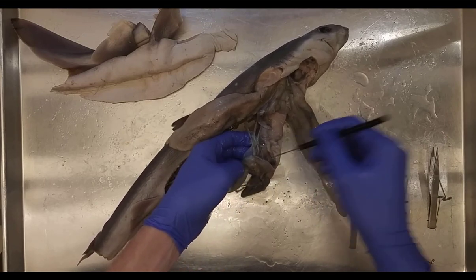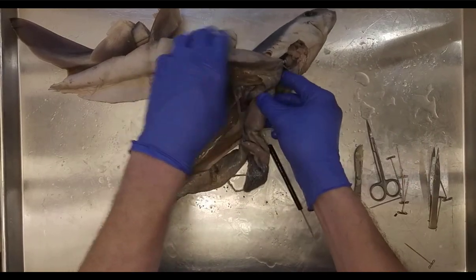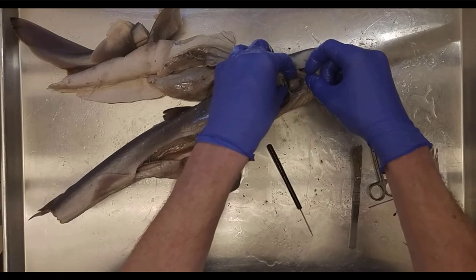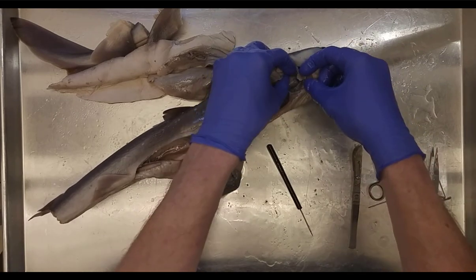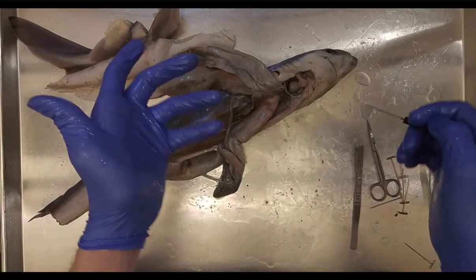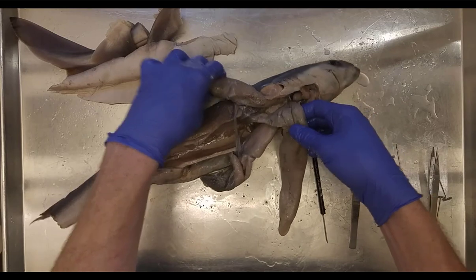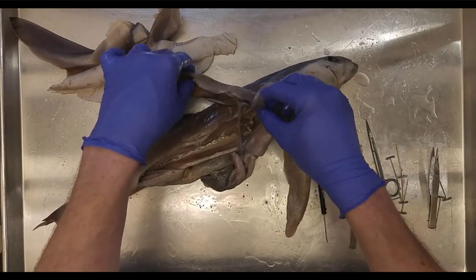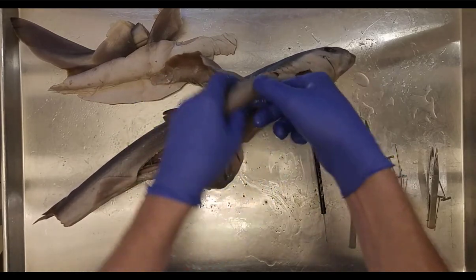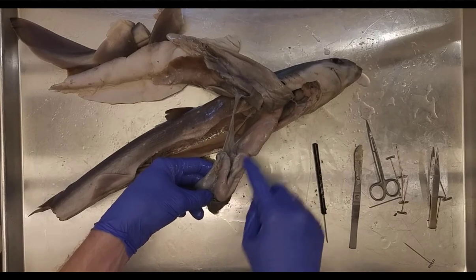The gallbladder sends bile via the bile duct to the duodenum, where it digests lipids. Up here we have the heart — just call this the ventricle; the atria are in the back but difficult to distinguish. The ventricle's job is to pump blood throughout the body. For the liver, specify right lobe, left lobe, or median lobe, and note the gallbladder alongside the median lobe with the bile duct.